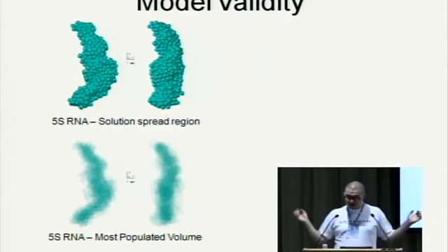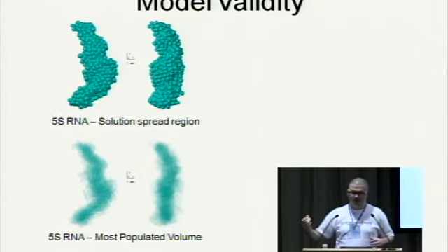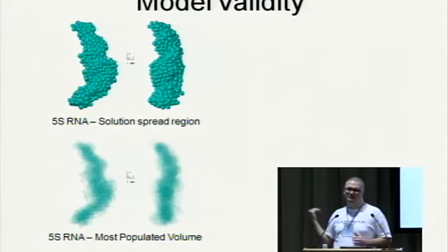Another approach, you can average all the models together and apply a certain threshold to this density to come up with a model that is the average of all models. However, this model will not necessarily fit the initial experimental data.